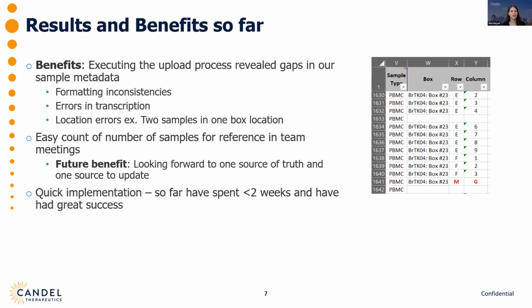And I just wanted to highlight that our implementation was a pretty quick process, thanks to the ease of use of the software, the really good documentation that's available, and also the amazing support from Hannah and the team in helping us work through all the different scenarios and how to represent our sample relationships. I spent just about 2 weeks setting up the sample structure and importing a few thousand aliquots. That allowed our team to meet our milestones in regard to this project and also move on to other projects.